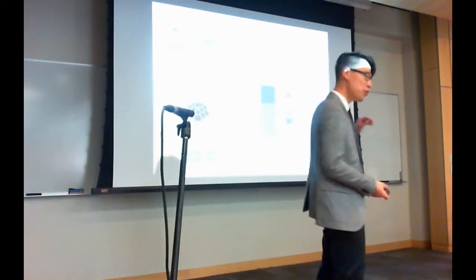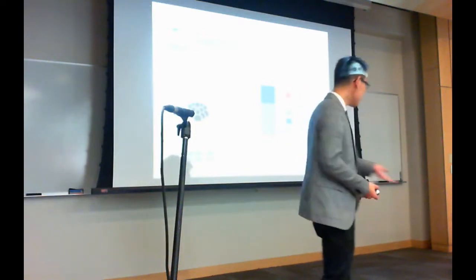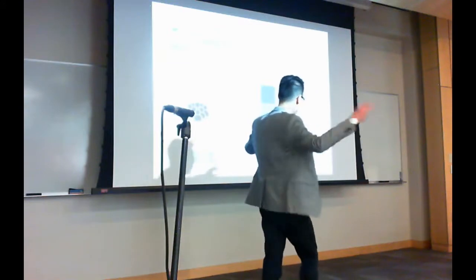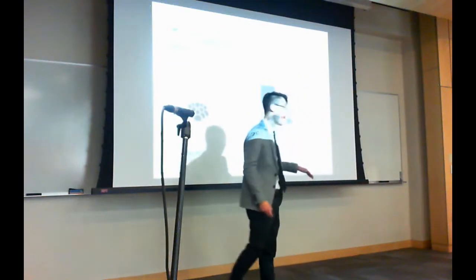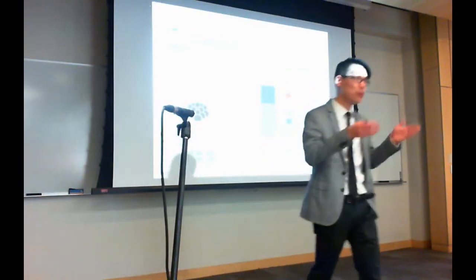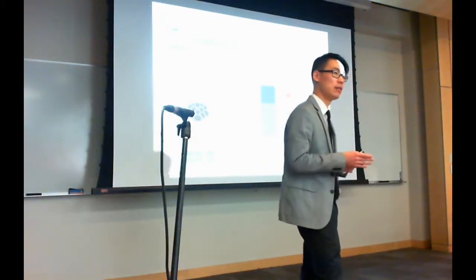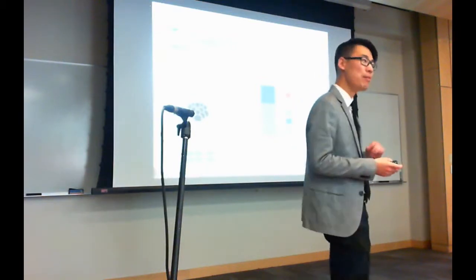And when we look at the utility of the library compounds that the community uploaded, we can see from the community and also from Peter's lab, they identified over 80% of the spectra in people's data, in real experimental data. And so it's been shown to be immensely useful.